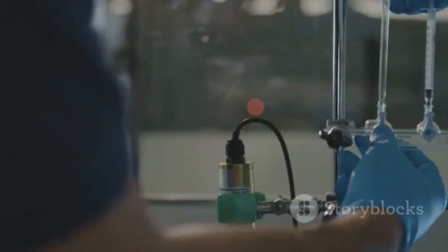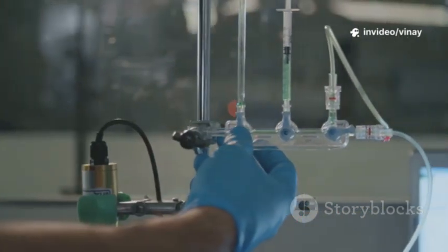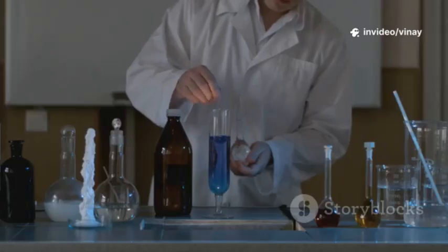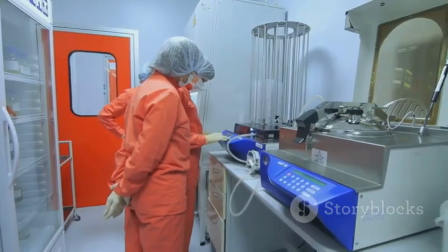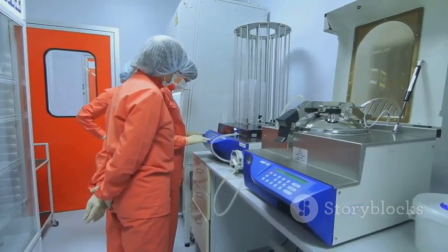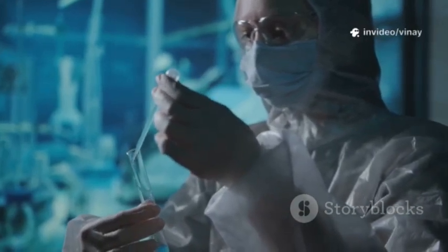So before and sometimes after we use a filter to make a batch of medicine, we run a special test on it. This test doesn't check if the medicine is good. It checks if the filter is good. It's a critical safety check, a scientific double check to protect people's health. The importance of this process cannot be overstated.